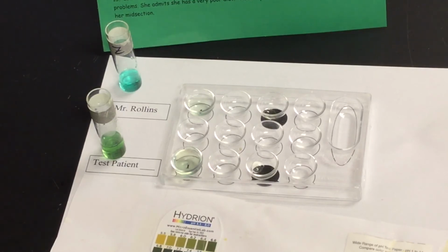At this point, go through and look at a microscopic view of that slide for patient number 13 and see if there's any other information in there. Do we have white blood cells? Do we have crystals? Do we have red blood cells? What's going on with this particular patient? Bacteria, cells, whatever it may be. Copy and paste that into your data chart, and then utilizing the data you collected, analyze it and come up with a solution or possible scenario of what this particular individual may have. You are going to follow your task material, and we'll talk about that a little bit later on.